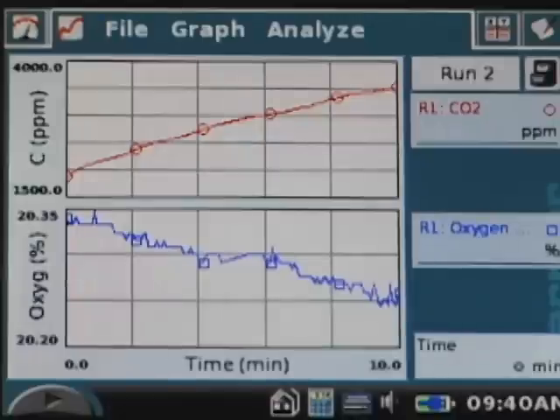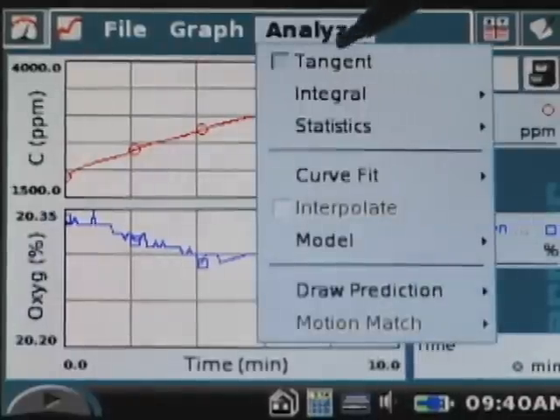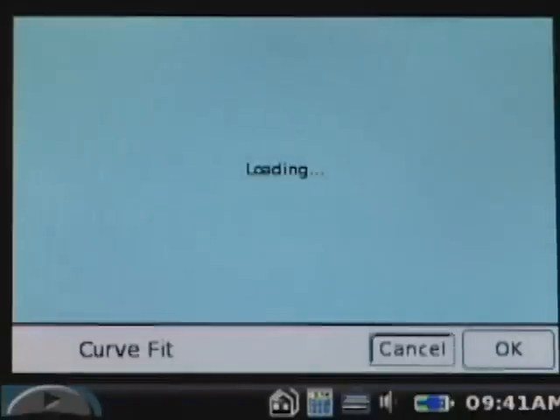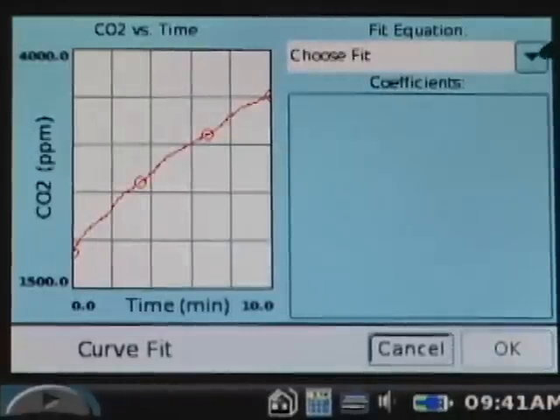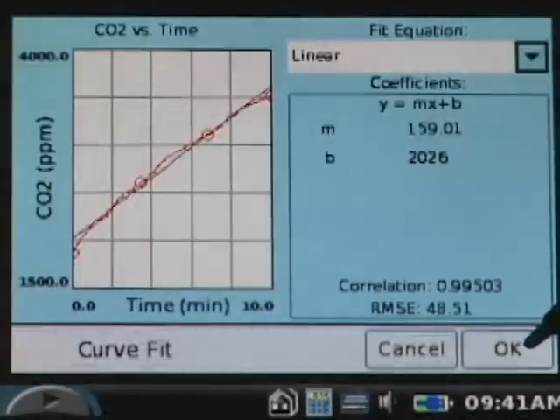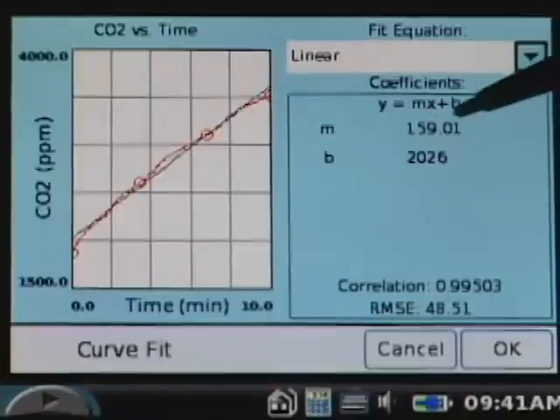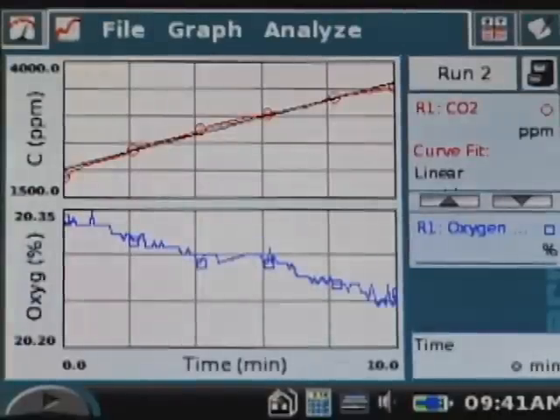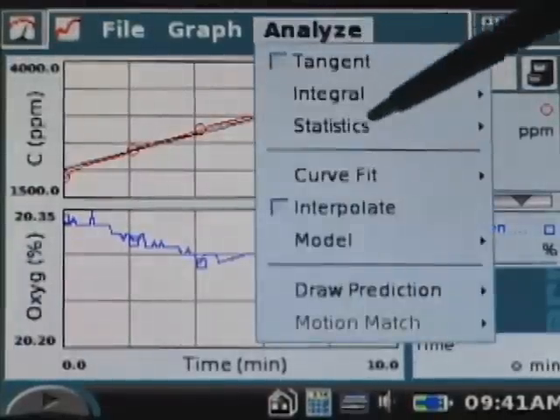To find the rate of respiration, we need to find the slope of the CO2 and the O2 graphs. To find the rate on the CO2 graph, choose Analyze, tap Curve Fit, and choose CO2. From the pull-down menu choose Linear, record the slope on your data table, and tap OK. Similarly, repeat the process for the oxygen gas graph.